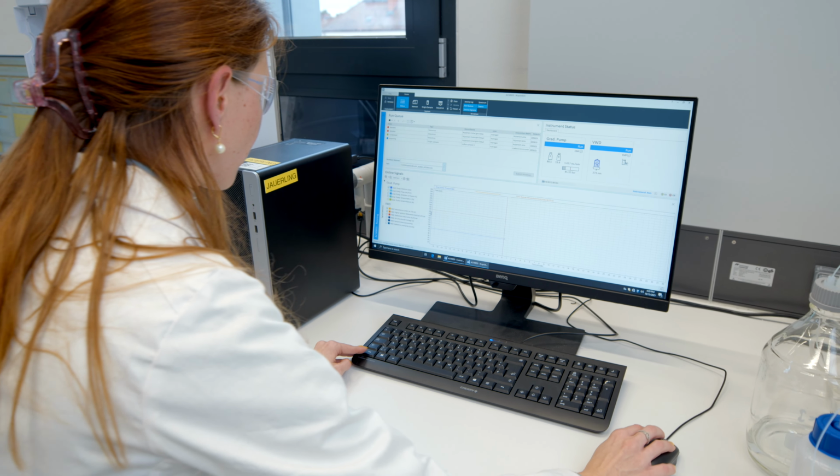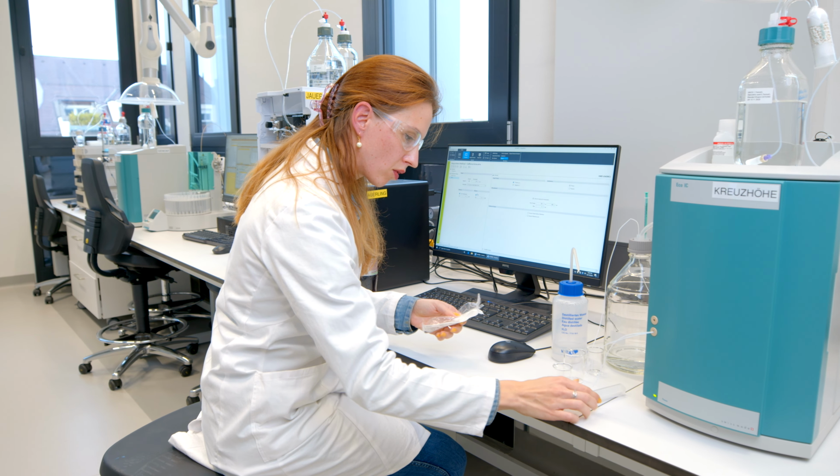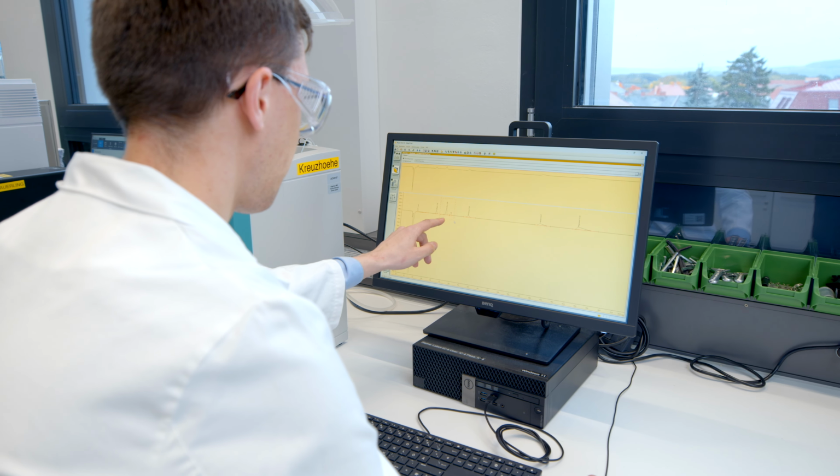These devices are typically used for the water analysis. We will analyze with you different water samples, tap water, mineral water, or the water from Danube, for example. We will check what ions are present in these water samples. By means of these devices, we will also analyze with you vegetables on the nitrate content and the fertilizers, and then we will compare it with the reference values typical for these particular plants or for this fertilizer.